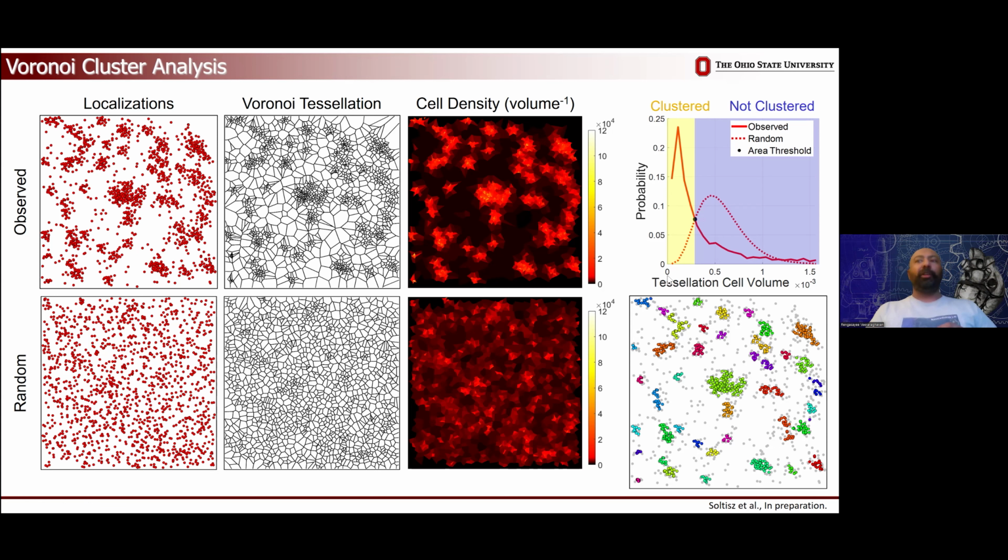We thought about it for a little while and figured, well, if you randomly throw points into 3D space, the nearest neighbor distances form a Poisson distribution, which means the tessellation cell volumes should also follow an a priori knowable distribution. Turned out to be the case, turned out to be a type of gamma distribution. And instead of doing all this painful Monte Carlo stuff, one equation, solve it in a fraction of a millisecond on your computer, you get the dotted line, now you know what's non-random clustering.